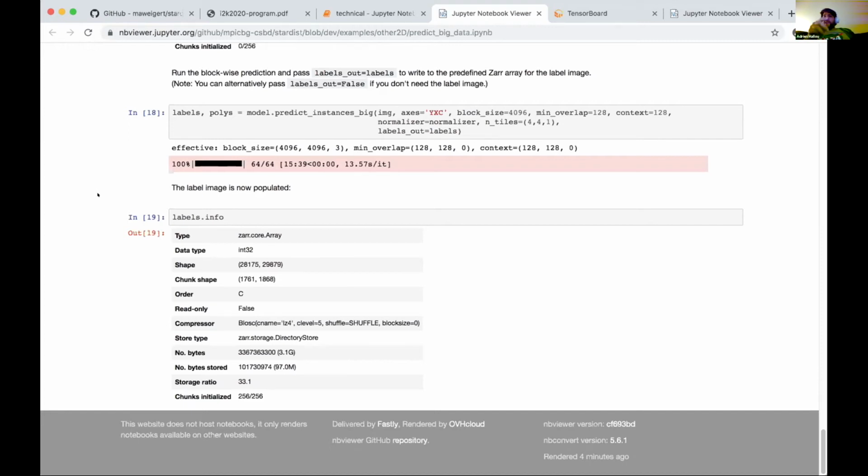So I understand this is possible within that framework, but I know from the deep learning literature there are many ways to do these things. Some people will just take the pre-trained model, load the weights and use them as a starting point of the training. I think this is called fine-tuning.